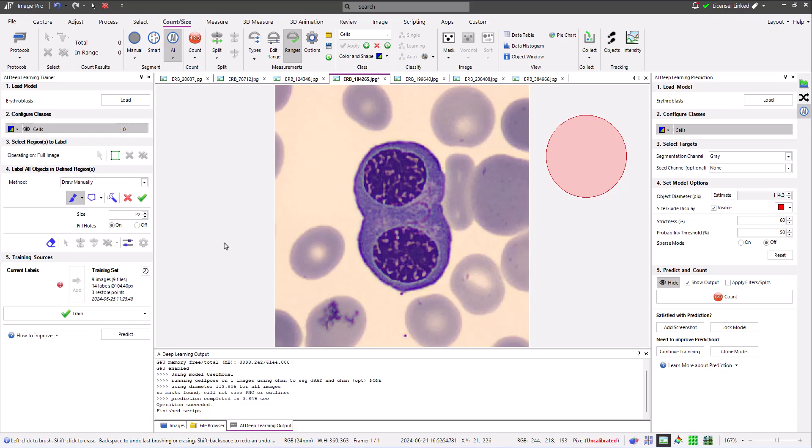In this image, the model fails to find anything, so I manually label the pair of joined erythrocytes before adding the labels to the training data.